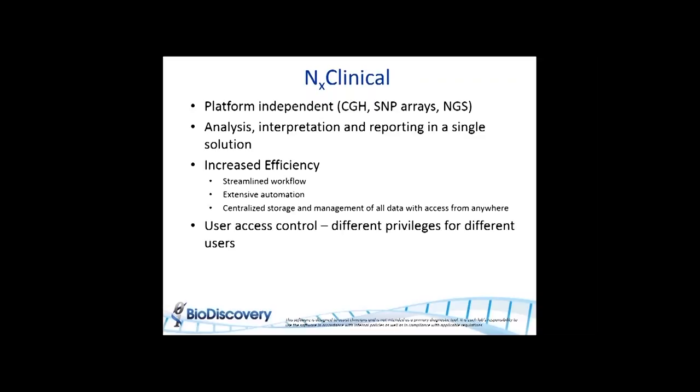The system also has different access control for different users, allowing each one to have a different role in the review process. So for example, some users may be able to just load and process the data. A different person might be the one reviewing it and can make notes and edits. There's also a system administrator that manages all the data as well as the type of data that can be loaded into the system. And this ensures consistency in that everyone's using the same tracks and annotation files.